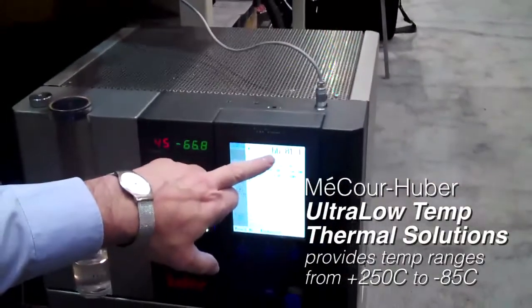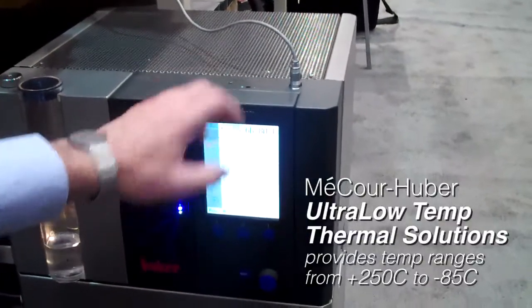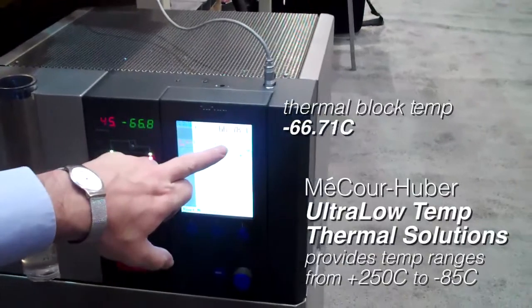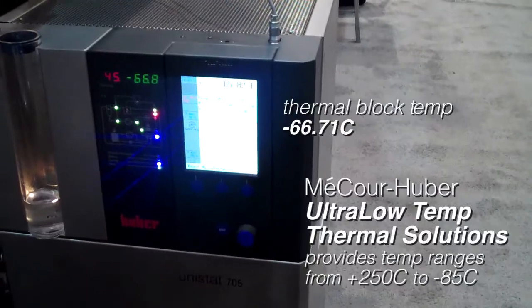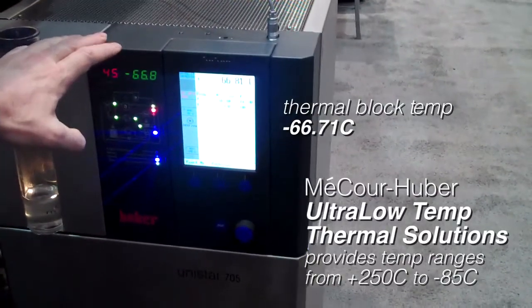The fluid is minus 66.8 leaving the Unistat, and we can see from the process sensor, which is located inside the thermal block, we're at minus 66.71. Only a very small difference between your thermal fluid and the application, showing excellent thermal transfer in the thermal block.